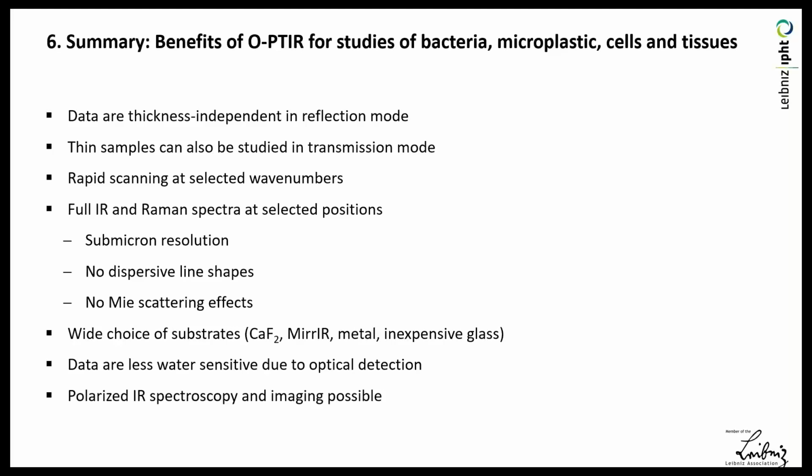several cell lines established in our lab, but at the time when we performed this experiment, these 6 cell lines were available. Both students were not very experienced in infrared spectroscopy of single cells, so I trained them, but after a few days they were able to collect good data. And of course the manuscript is under preparation, and I hope to publish it in the next months.